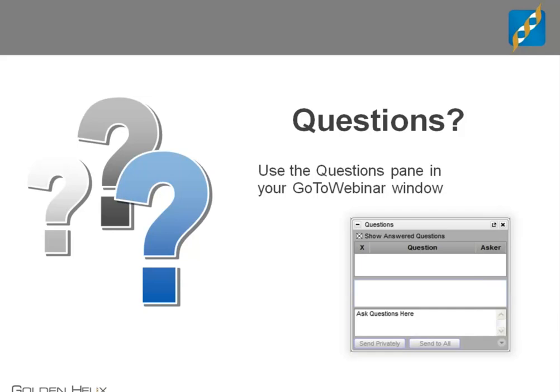Another question, are all of these algorithms intended for human genes? Is there any that would be appropriate for plant genes? A few of them are definitely applicable to additional species beyond human, and there's a lot of low-level user control for controlling which databases you use for constructing your alignments. Particularly with SIFT, you have that ability. And some of the algorithms that I did not demonstrate today, I think Panther in particular can help with that. It's a very good question.